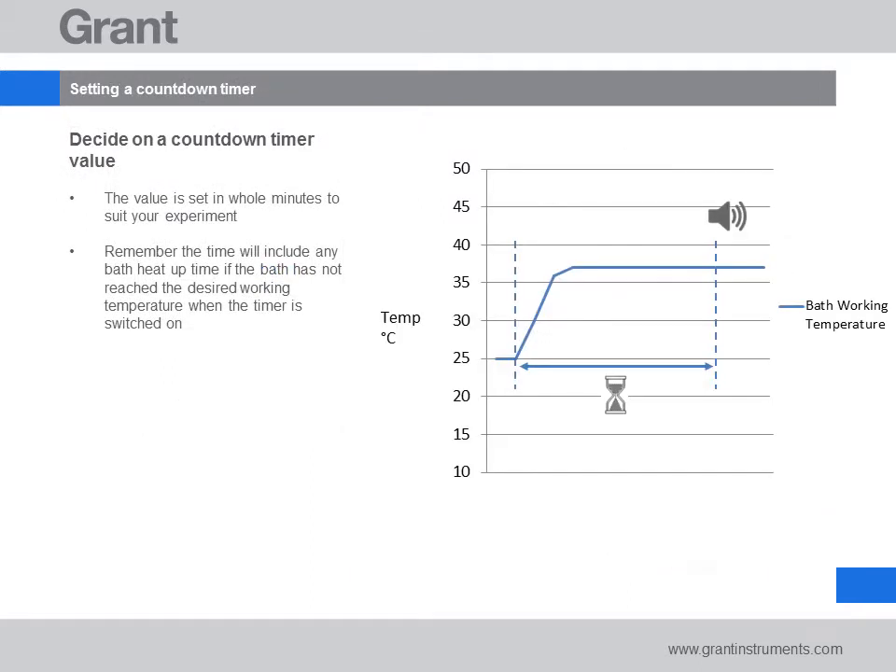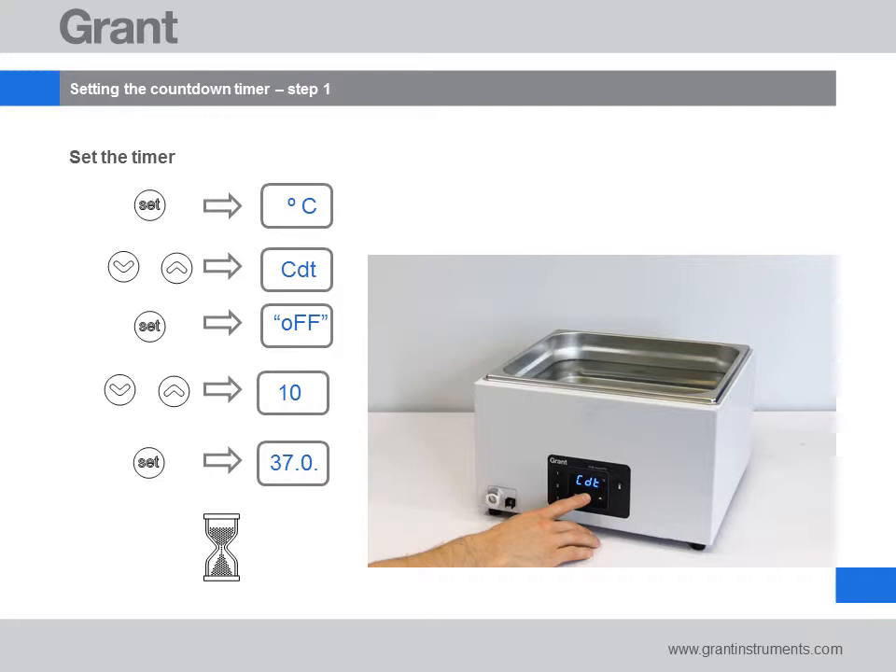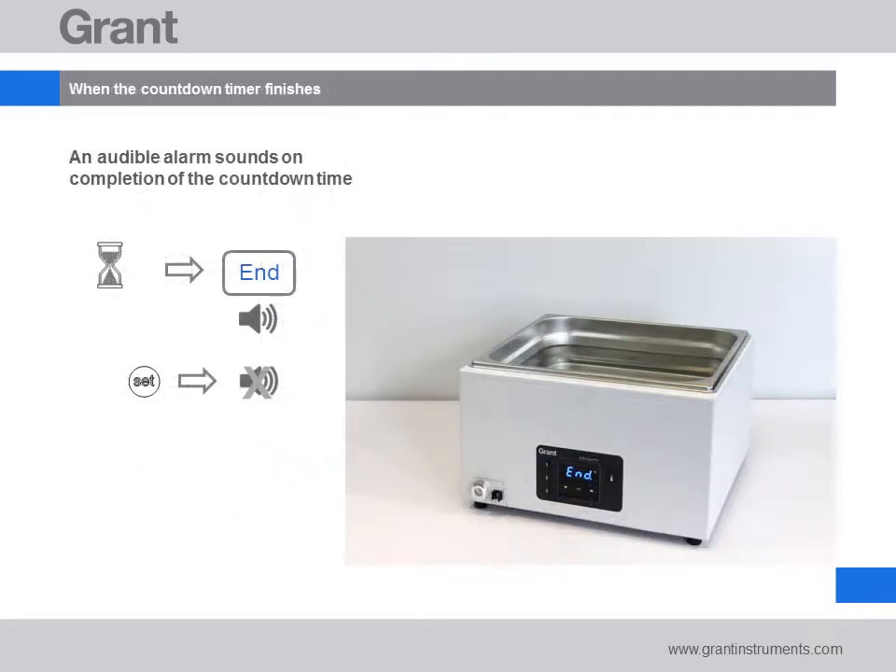Moving on to the countdown timer — you can set this to a value between 1 and 999 minutes. Choose the value you want, remembering that if the bath has just been switched on, the heat up time for the water will be included in the countdown timer period. Press set to get to the menu options on the display. Use up and down to get to the countdown menu, shown as 'CDT' on the display. Press set again and if the timer has never been set you will see 'off'; otherwise you will see the value it was last set to. Adjust to the time value you want — in our example we use 10 minutes. Press set to start the timer. An extra dot on the display will show the timer is running. When the timer ends an alarm will sound. You can silence the alarm by pressing set.